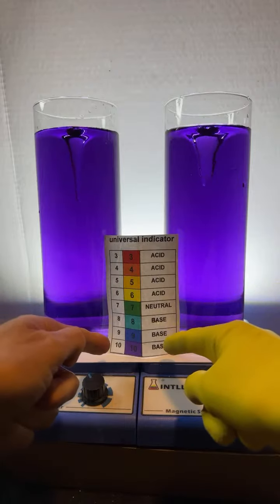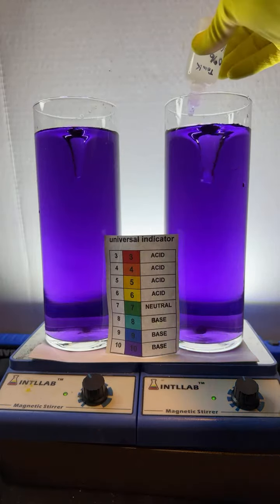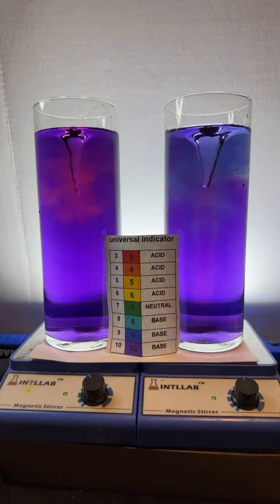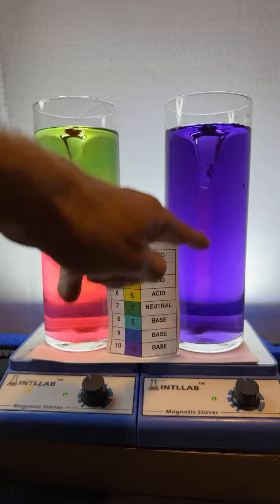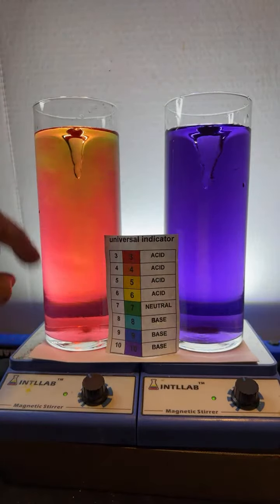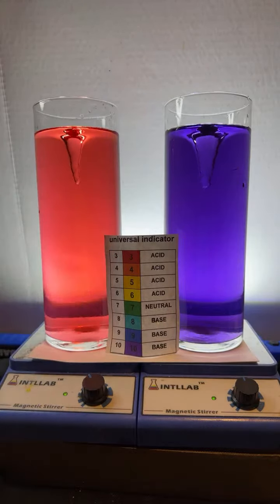If I want to neutralize the base, I'll need to add acid. The acid that I'm going to be adding is hydrochloric acid. It's the same acid that's found in your stomach. I'm going to add one little drop here on the right, and let's do 2 drops over here on the left. See what happens. As I add 1 drop, I can see some red in the middle where the acid kind of remains. And oh, look at that over here. It looks like I added an excess of acid. The pH dropped from 10 all the way to 3. So we went from base to acid.